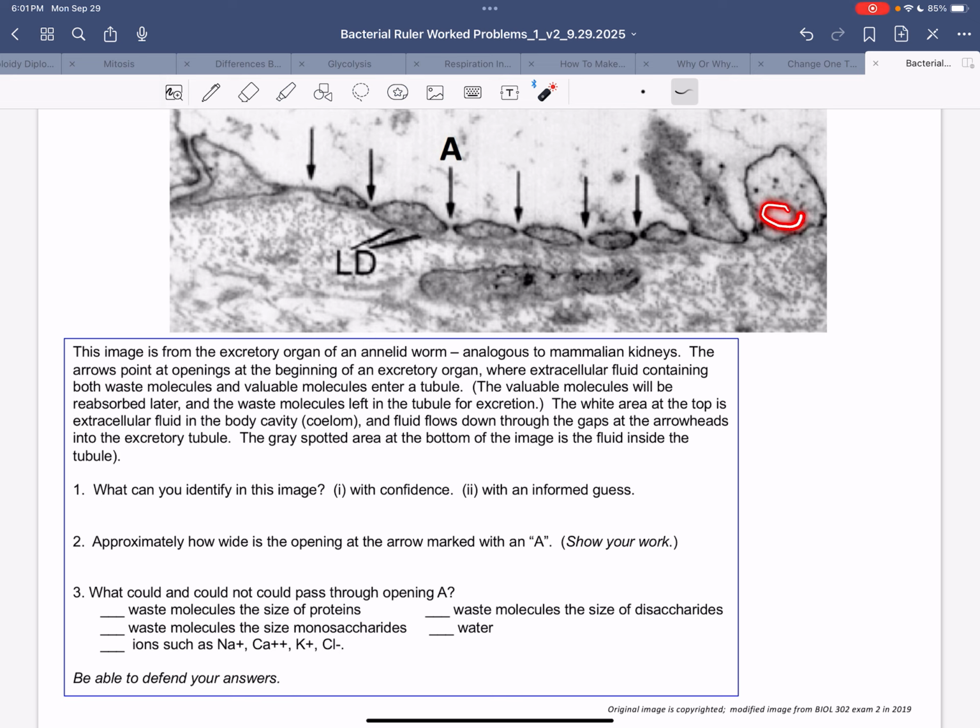This might be a vesicle, but it could be. It's pretty small, but there are some vesicles that size. There are some dark dots here, which in other images I might think were ribosomes. And it's possible, I'm guessing here, it's more likely something else, but they could be. But let's think about it. If this is a membrane, then that is about 7 to 8 nanometers, or we'll round to 10 nanometers.